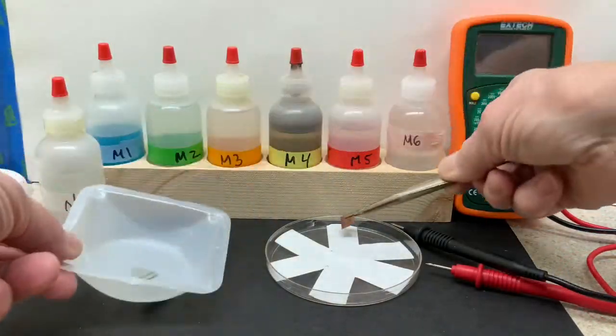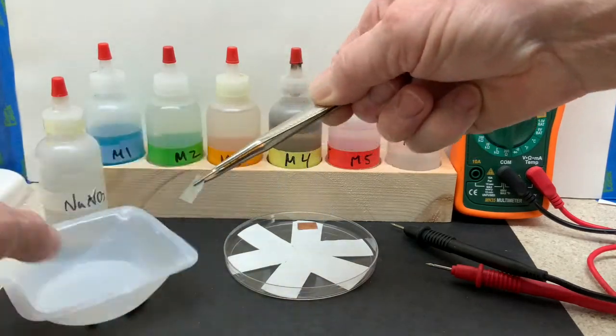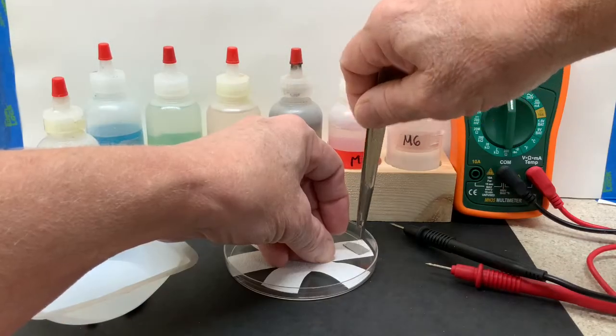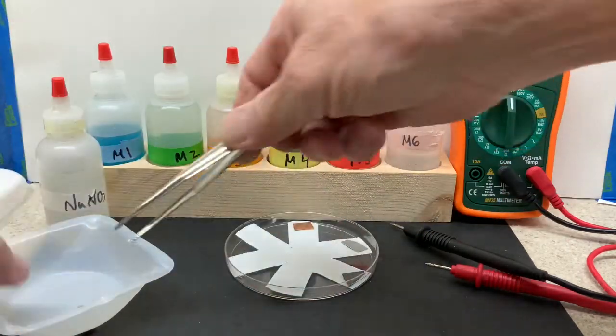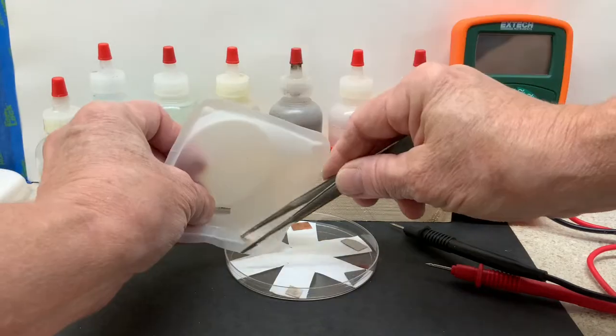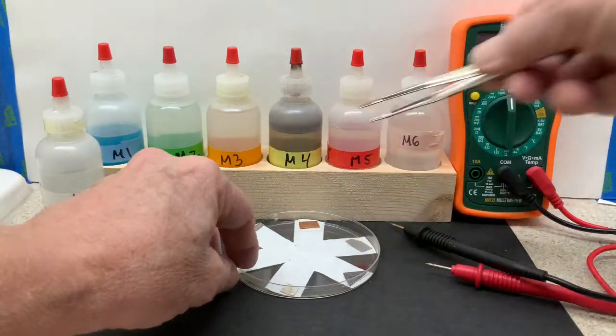Into the top of the petri dish, place the metals one at a time: metal one, metal two, metal three, all the way around on the outside of each spoke. Metal four, metal five, and then metal six.